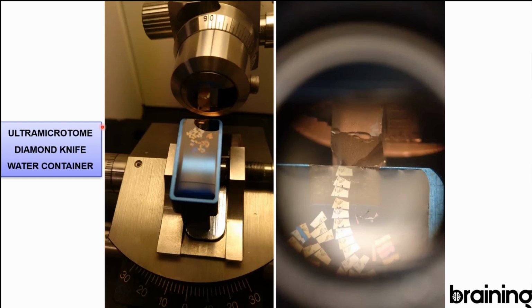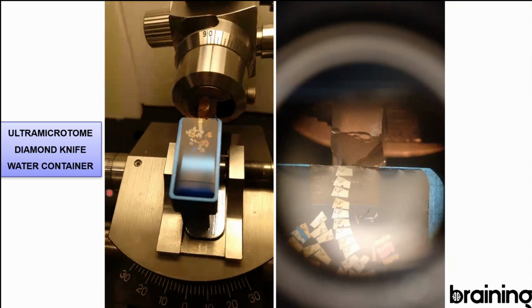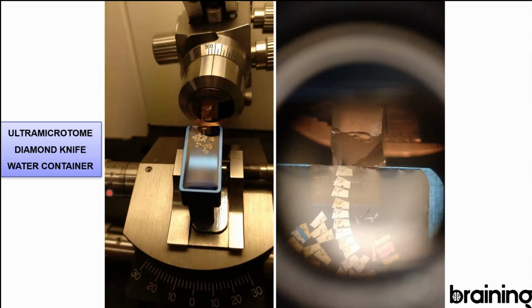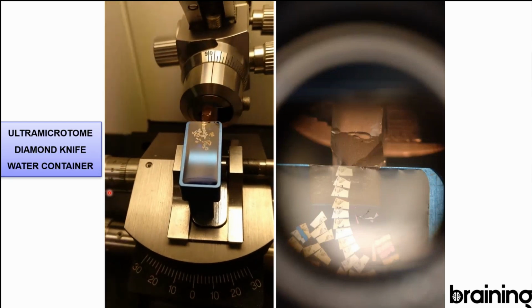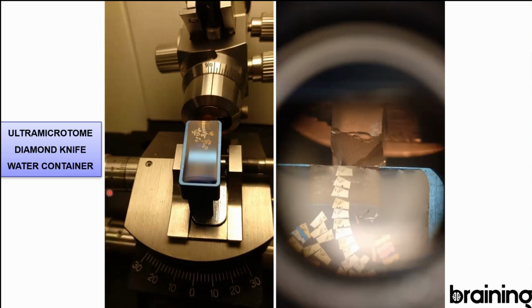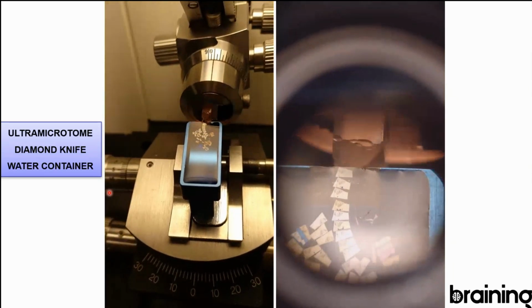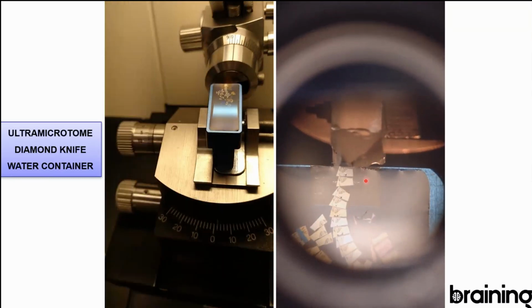And now I'm going to put, I hope that the video plays, and you can see how I get the sections. Okay, yeah, it's playing. Can you see the video? Playing? Yes. Great. Okay, so you see that the block is passing through the knife, and I'm going to turn on the other video so you can see through the eyepiece. And those are the thin sections.